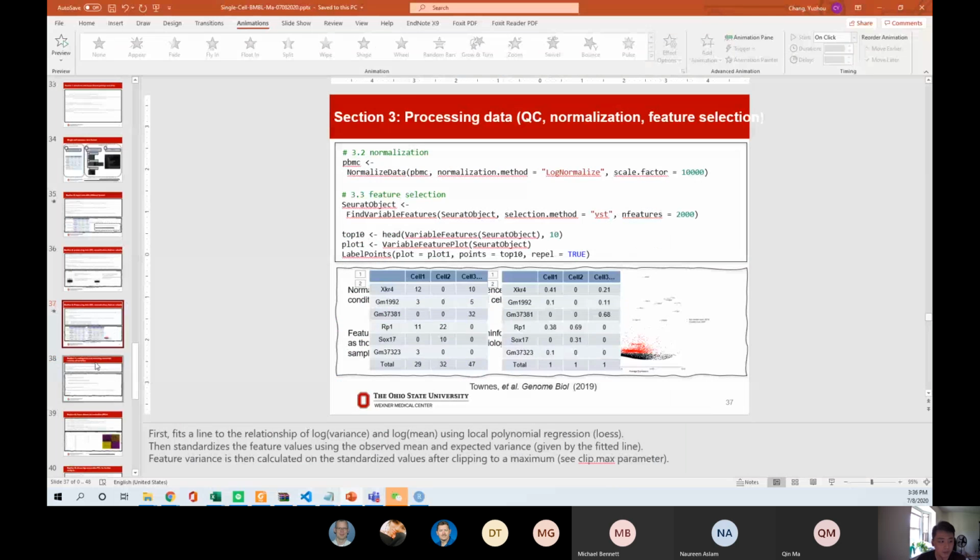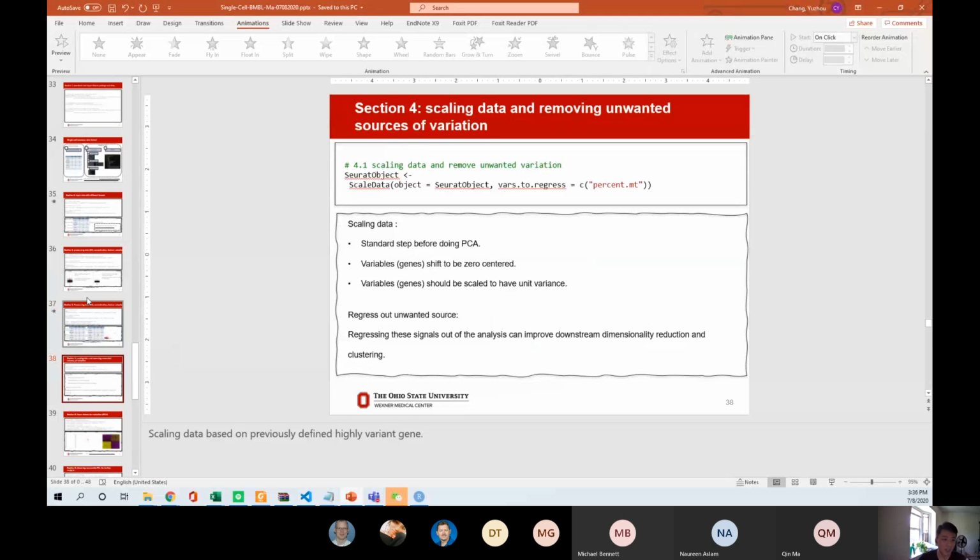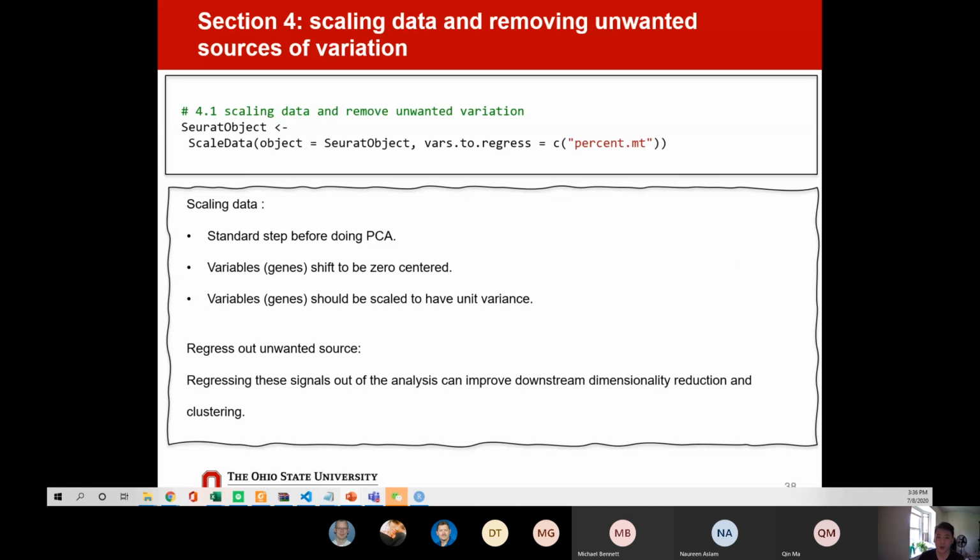And then after we got those 2000 genes, we cannot go directly to further analysis because the dimension is still high. Although it has already decreased from 30,000 to 2,000, 2,000 is still a little bit high for the computer and for us. So we need to further do dimension reduction. In this manner, we use PCA to do the first dimension reduction.